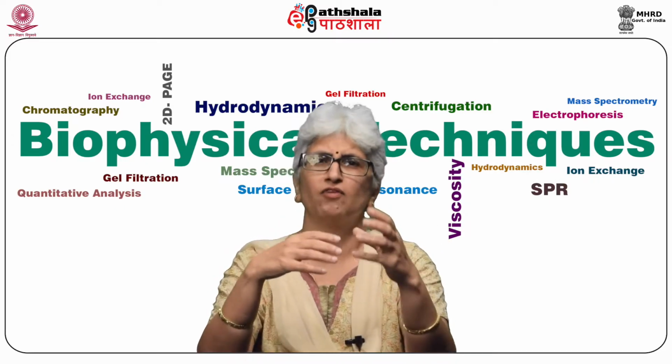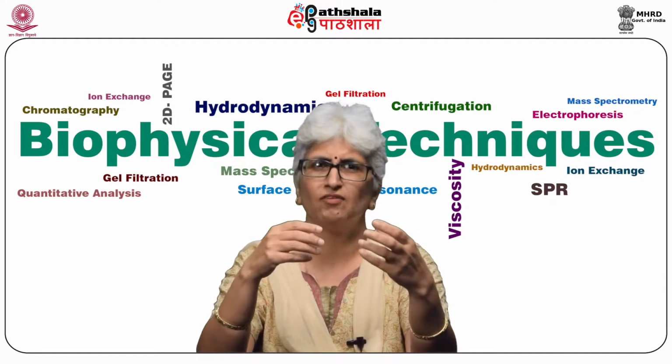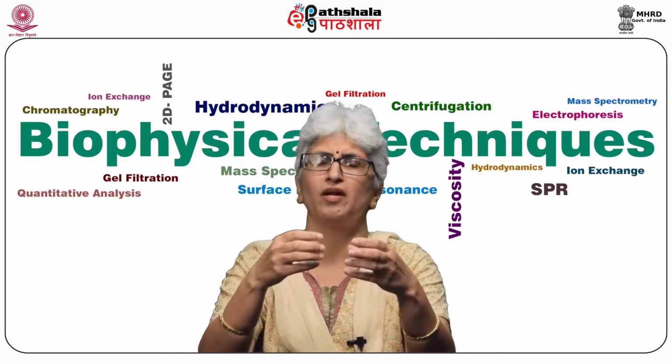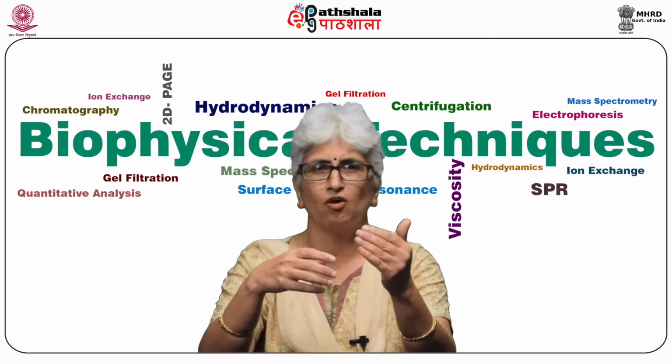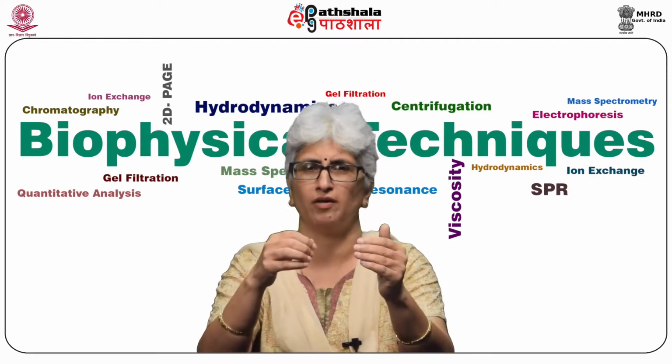Now, orientation of the ligand is also important. If the ligand is oriented in such a way that it is not able to bind your target molecule properly, you will lose your target molecule in the process. So, selection of affinity ligand for any kind of affinity chromatography is very important.